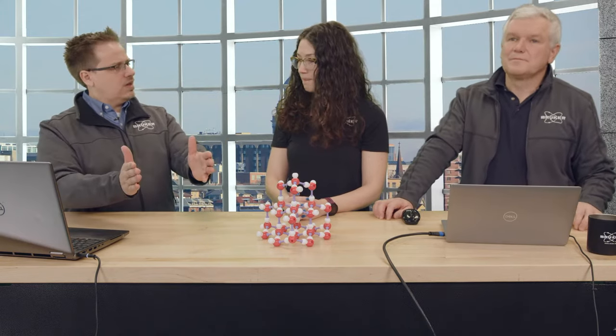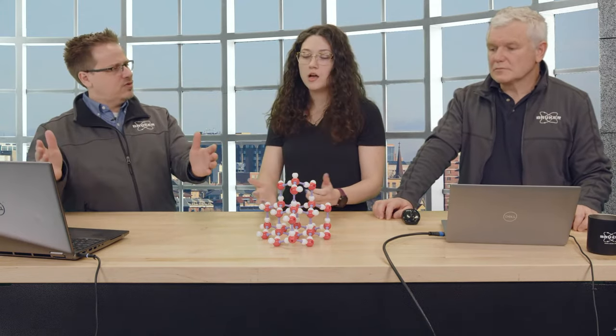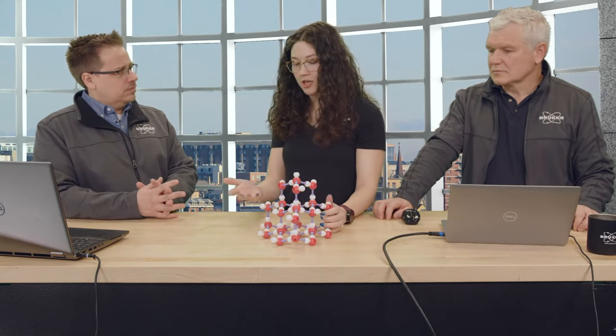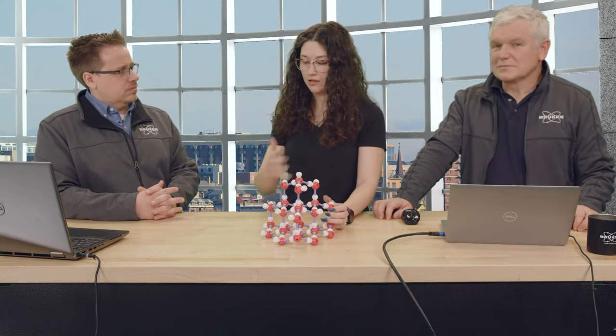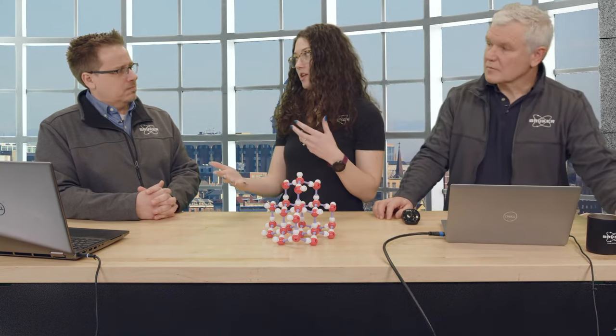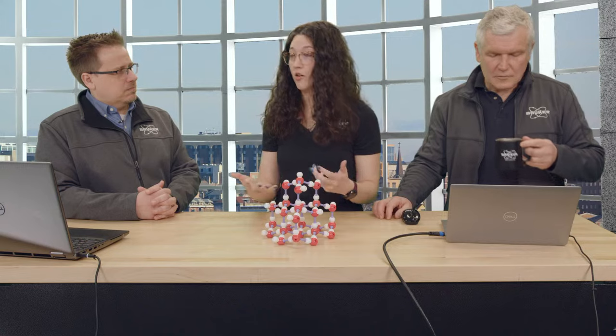Yes. Now, on what order is this typically? If we say there's a 1 unit cell distance, is this like every 5 unit cells, 10, 100? It varies on the structure, and whether or not that repeating amount is an integer or not will also change the way that you go about solving that structure.